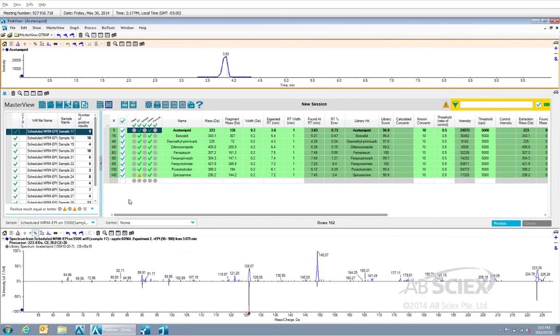From here, we can review all of the positive residues identified in our samples very quickly.